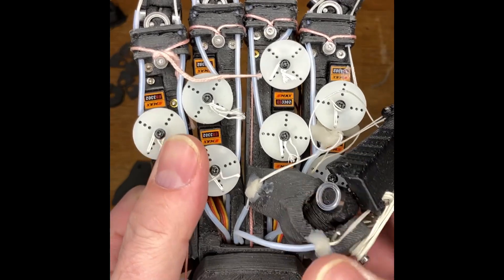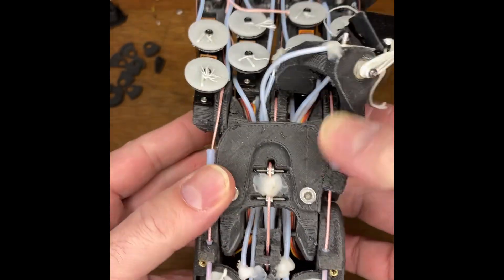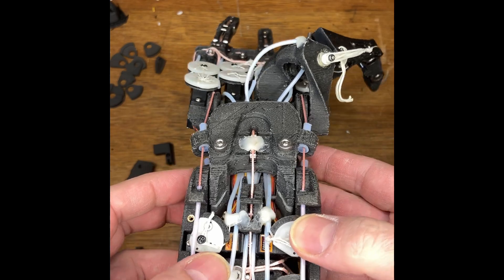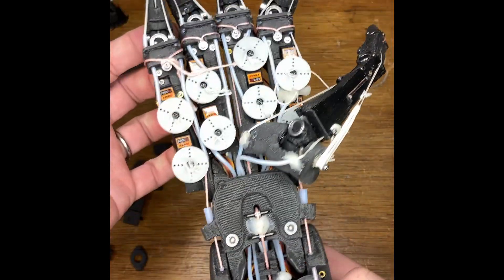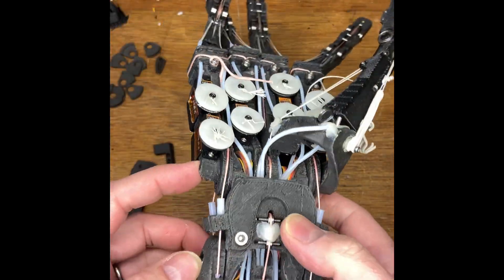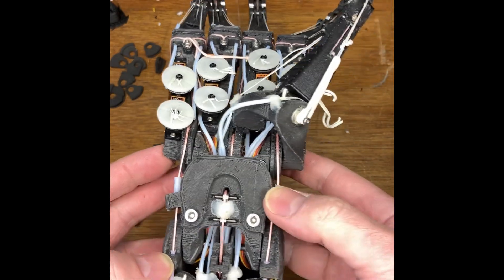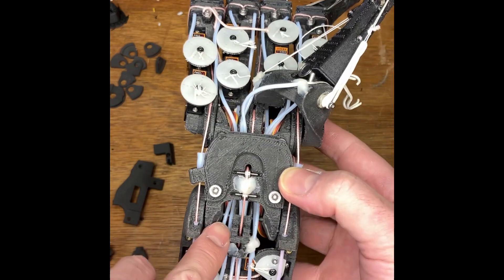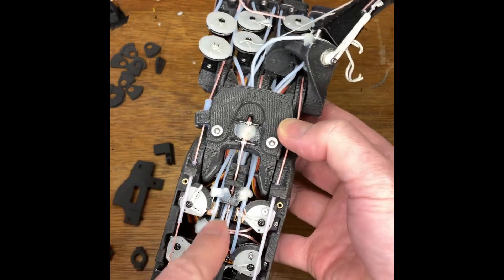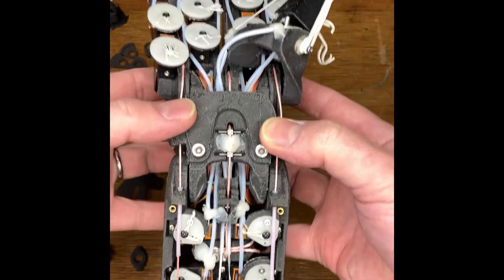You can see how all the PTFE tubes pass down through the center of the wrist. An important decision to be made is whether you pass them above or below the pitch joints — in this case they're generally passing above. For the thumb it's different: the thumb passes through the middle of this bulkhead. You have to clean those holes out or drill them, and then you'll find which servo they go down to.